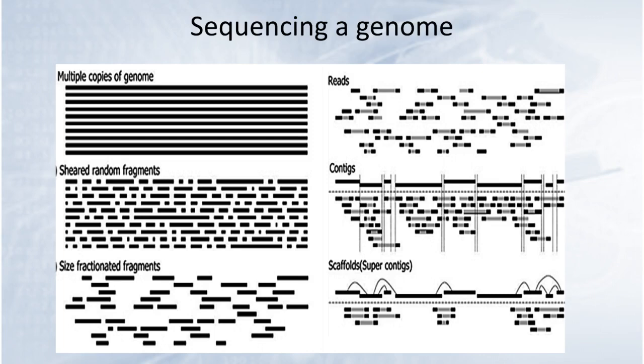And so as part of this, we take those through a process because it's not very efficient to sequence the little tiny fragments. If you think about it, we're trying to generate sequences that are 250 base pairs from each end of the original fragments. And so if the original fragment is less than 250 base pairs, then we're kind of wasting sequence and we'll just be sequencing adapters or out into the middle of space. So we like to keep those as large as possible. But when you're looking at the QC of your sequences, you'll see how close we came to doing a perfect job of that.